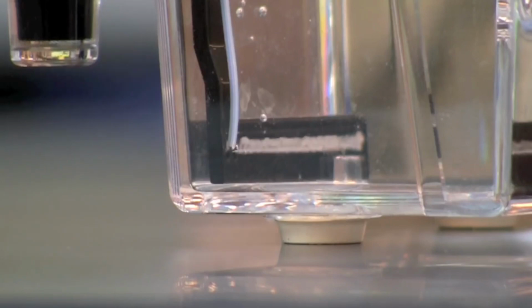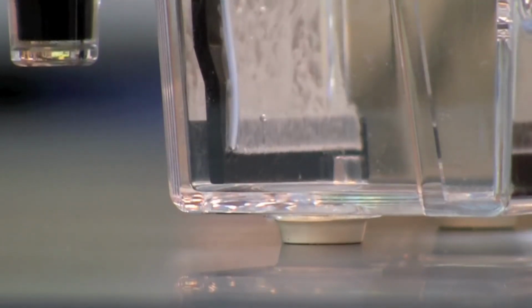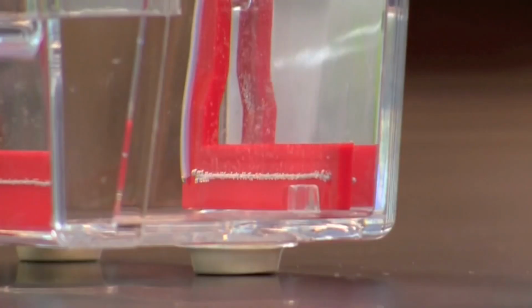You will begin to see bubbles start forming. As you look closer, you'll notice that the red side has significantly fewer bubbles than the black side. After a couple of minutes, you will begin to see the samples moving through the gel.